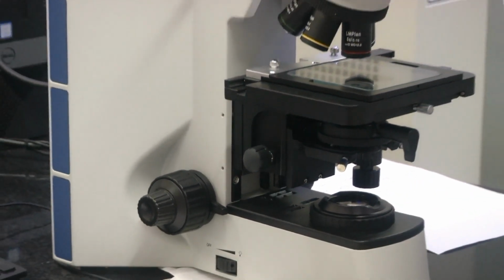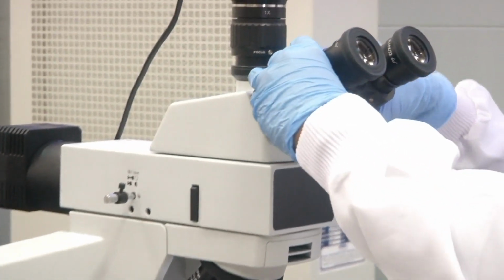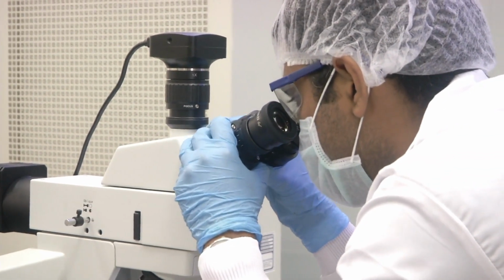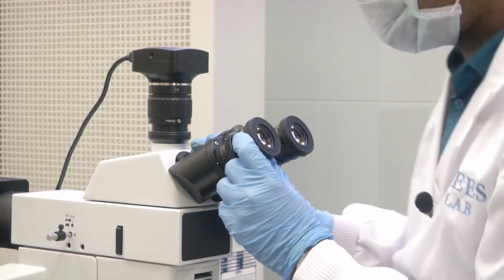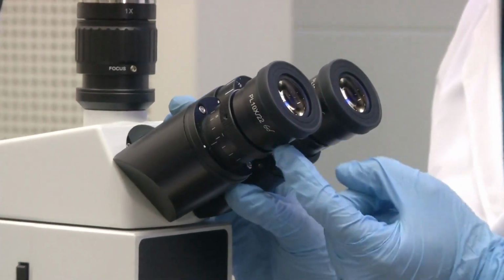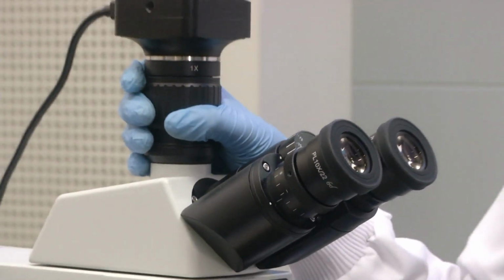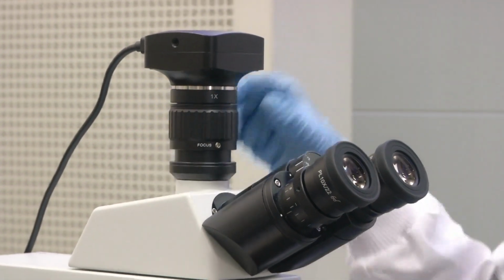Then this is the eyepiece. You can move this eyepiece around, so that it will suit your eye, whatever the shape of your eye, accordingly you can adjust your eyepiece. This eyepiece has 10x magnification, as you can see here. 10x is written here, and whatever is seen by the eyepiece is also captured by this camera. This is the camera.